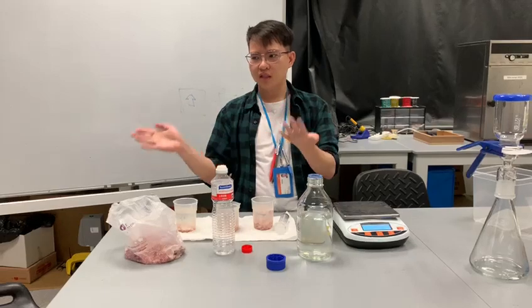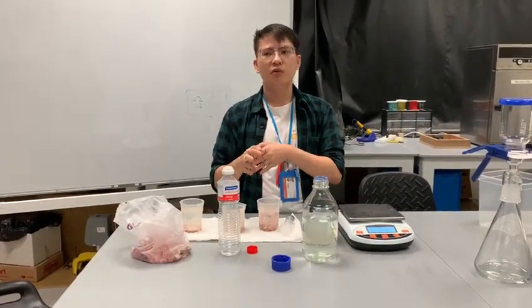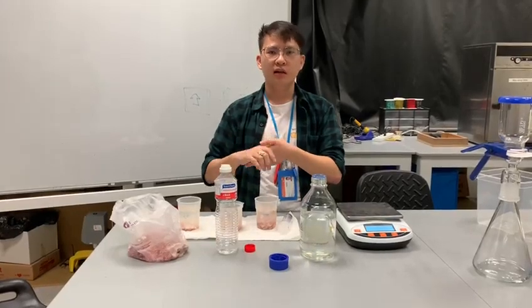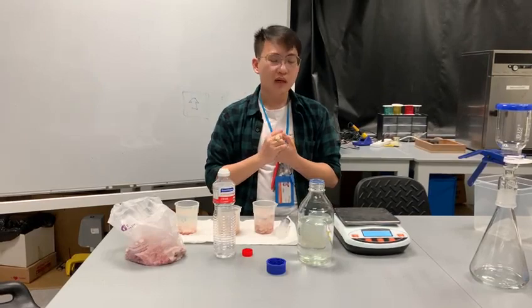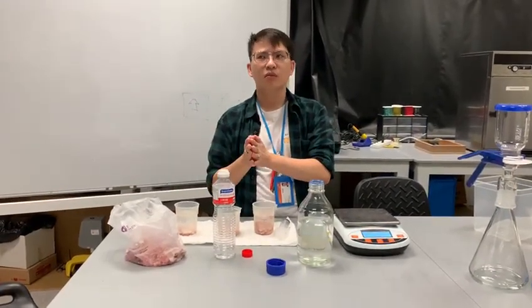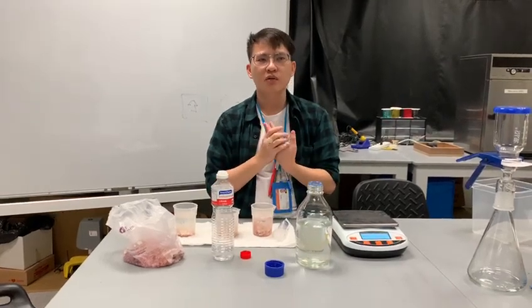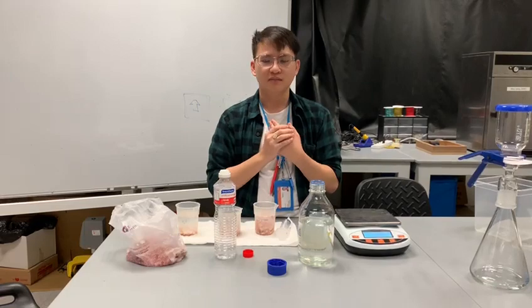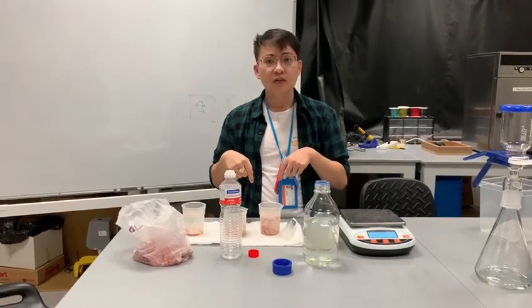After this, we will let it stay for a few days, and then we will measure the mass every single day for a duration of 1 week. The data will be given to you over this 1 week, and then you will analyze the data and write it inside your lab 0 journal entry. I'll take the observations.